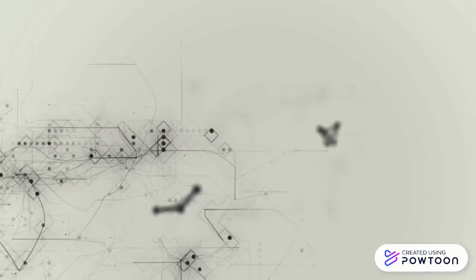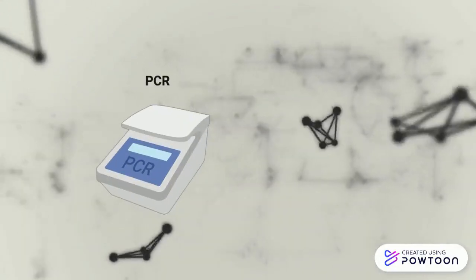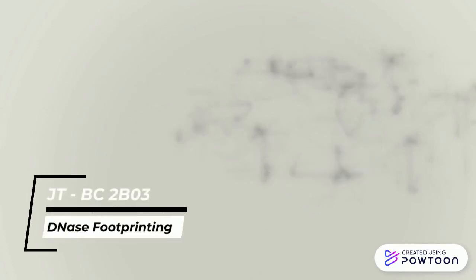Discoveries of new research techniques in the field of biochemistry have been increasing more than ever in the past century. Many of these techniques use combinations of foundational methods, especially PCR for amplifying nucleic acid segments, and gel electrophoresis for separating DNA, RNA, and protein molecules. Today, we'll discuss DNase footprinting, a method that uses these two techniques to study specific protein-DNA interactions.